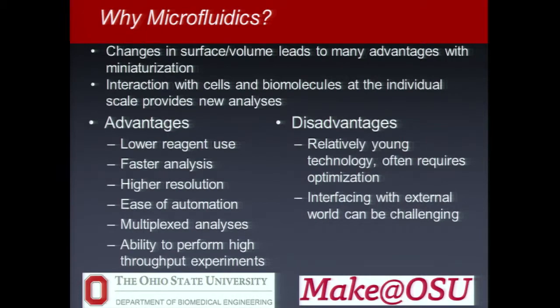Now, there are some disadvantages. It's still relatively young, so while there are commercial products, there's still a bit of a learning curve on those commercial products. And when you're talking about working with very small volumes, how do you get a very small volume into a confined space? It can be a bit of an issue. But just as an example that these exist, they are on the market.